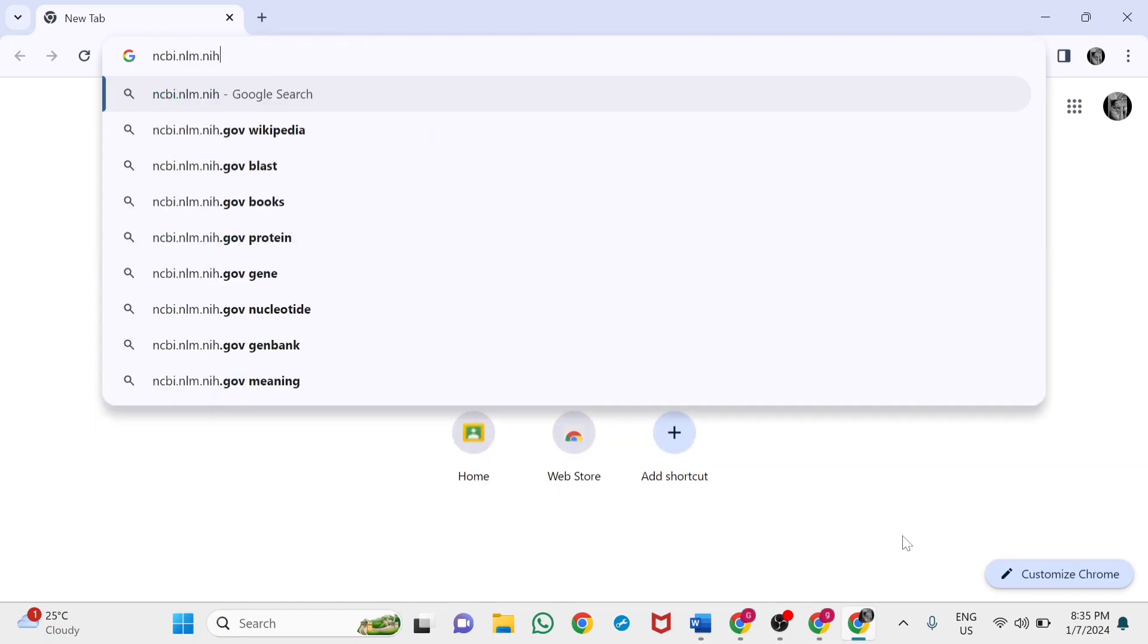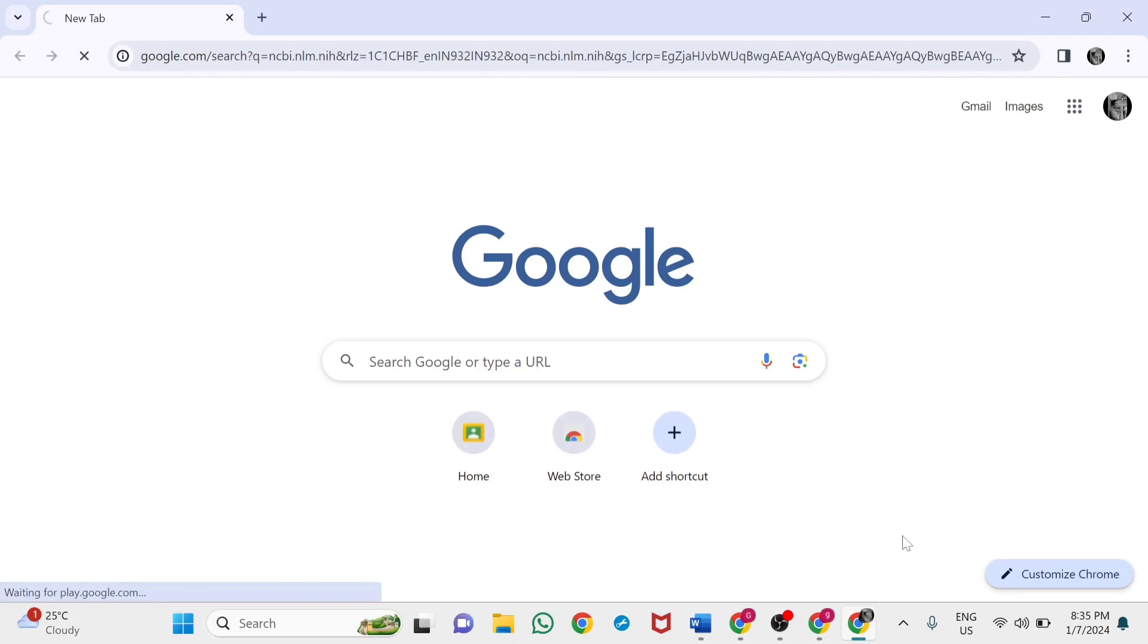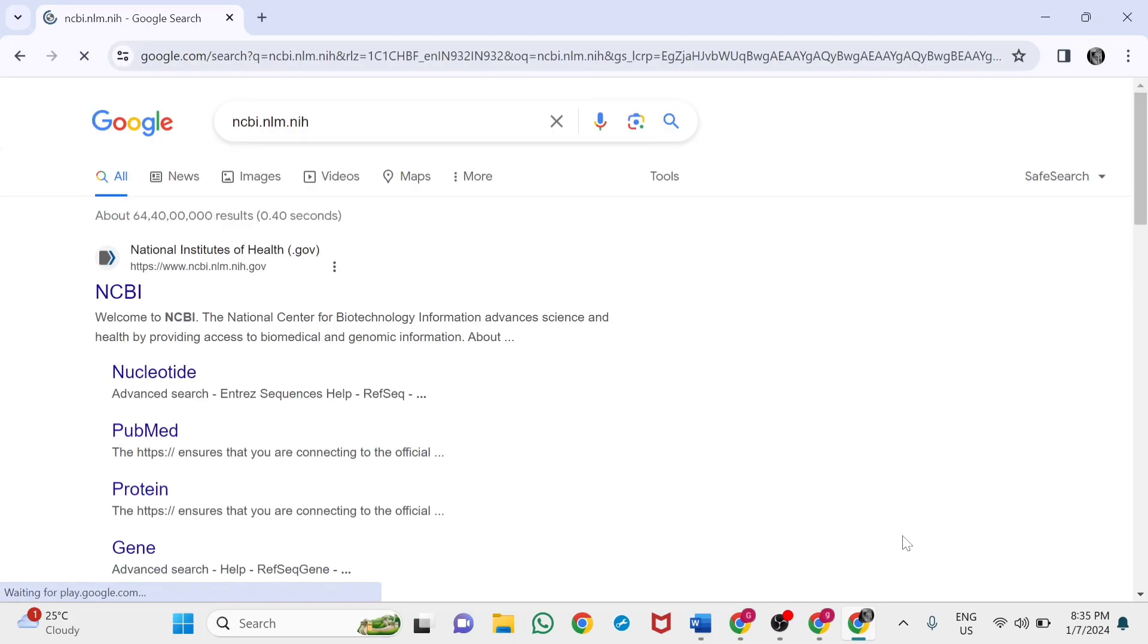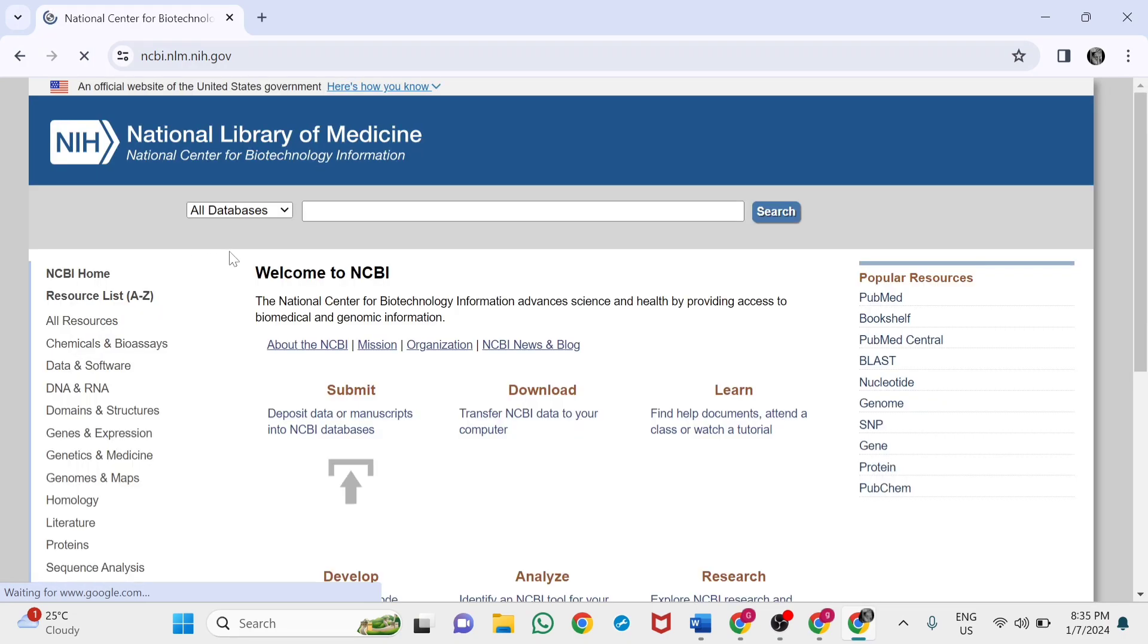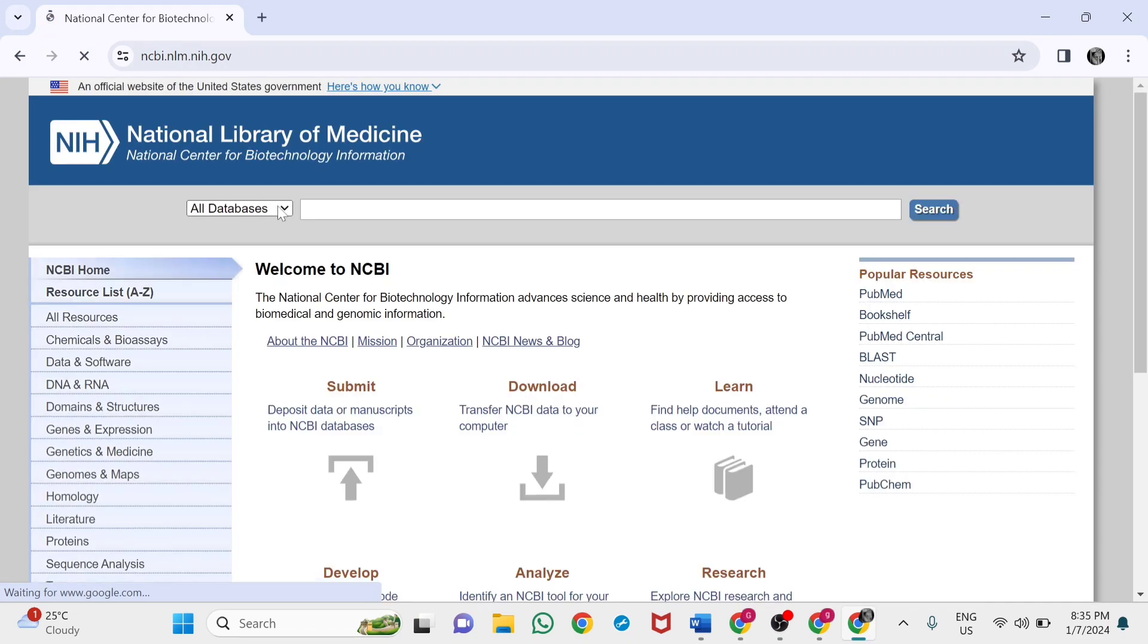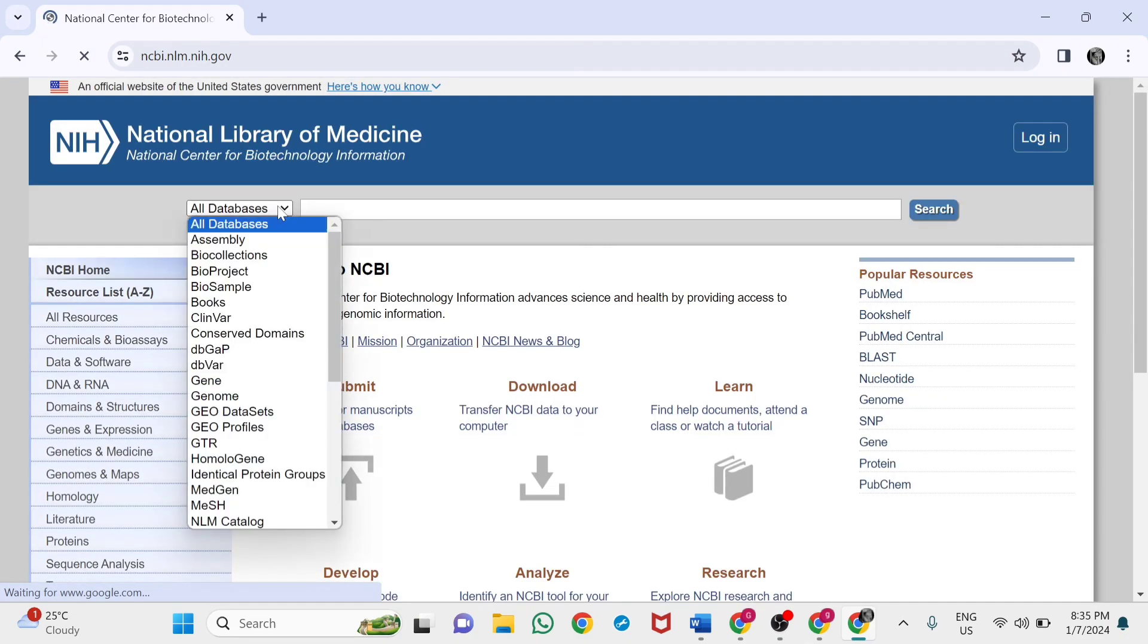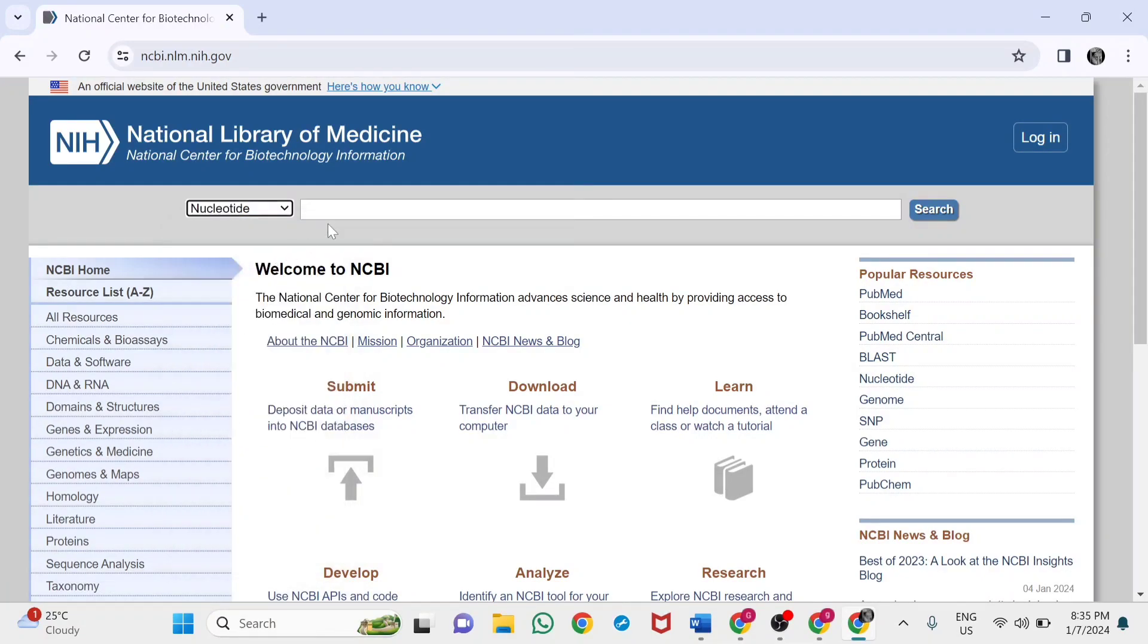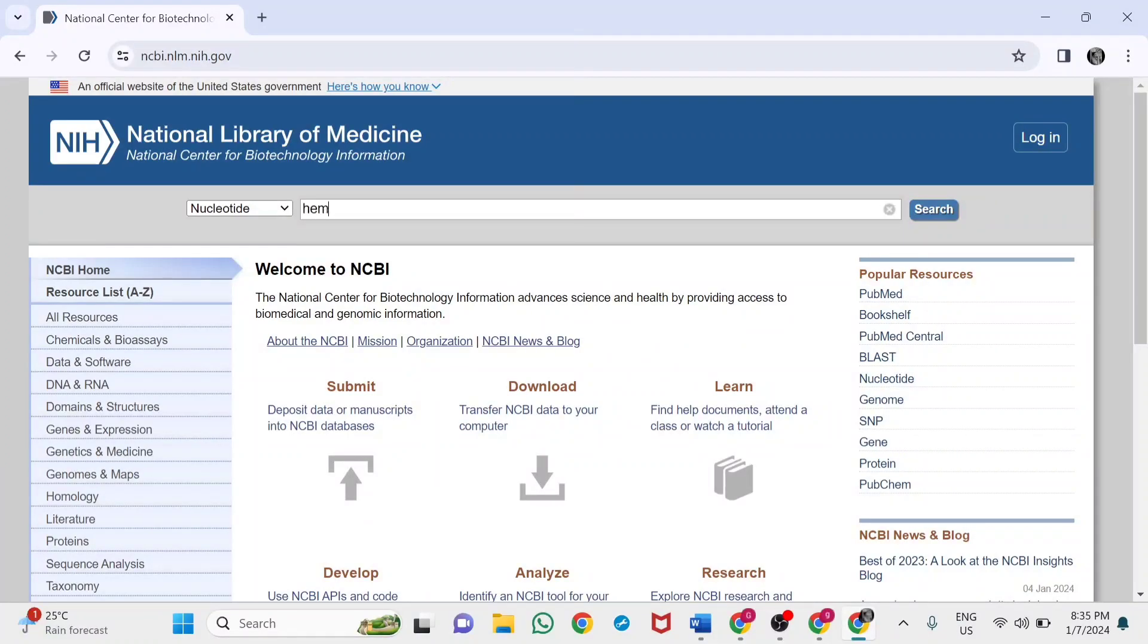This will take you to the NCBI website. From the all databases menu, select nucleotide. Enter the protein you need to know about. I'm entering hemoglobin.